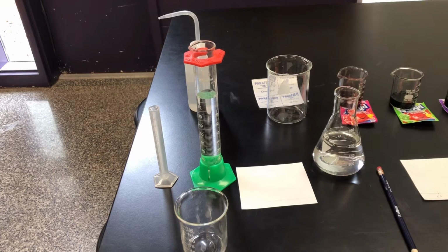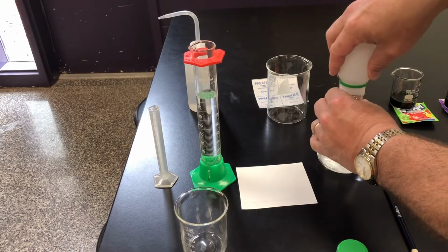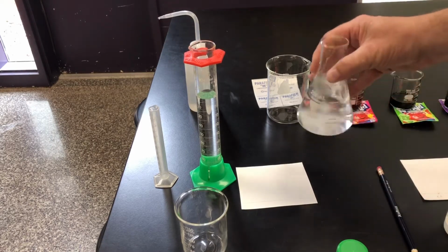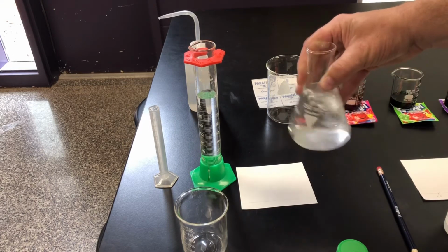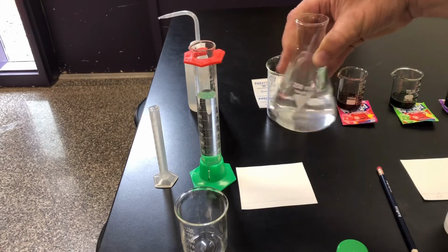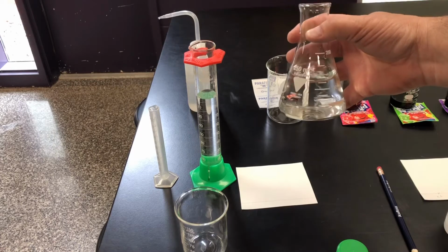If I put this in here, that's going to give me a 1% solution, right? In lab, this would be made up for you. We would dissolve this, and luckily, sodium chloride dissolves pretty well, pretty quickly. So at this point, this is a 1% solution.